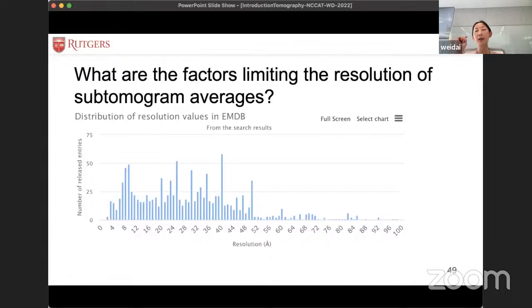I can, one very obvious one, and some of you actually mentioned it already, is the particle number. So you have finished your single particle modules already. For an average single particle project, how many particles are we talking about? Millions, I guess. Yeah, right.